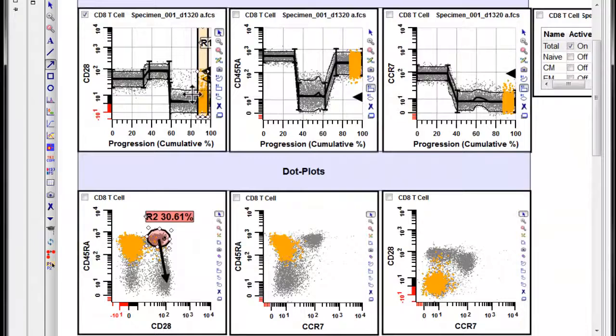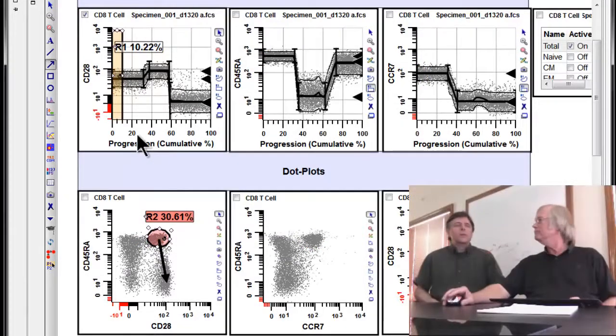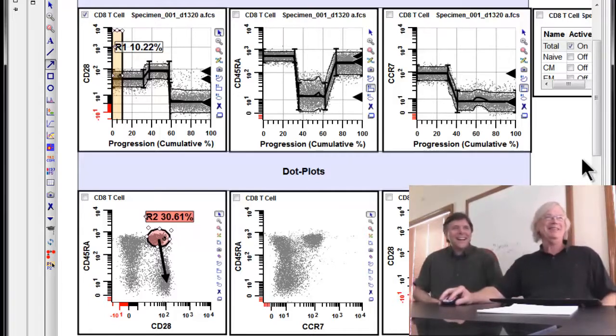All right, let's put this region back to where it was, and I'll turn off the animation. Okay, so I noticed over in the right-hand corner, Bruce, there's a little box. It looks like it's got maybe stages of the progression identified. You're probably going to want to tell me about that. Thank you, Ben. I probably will.